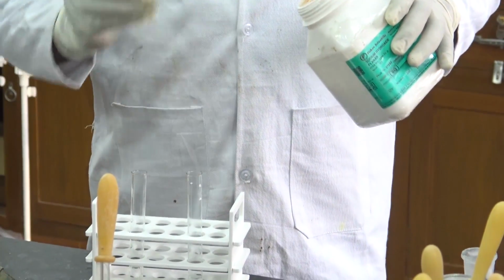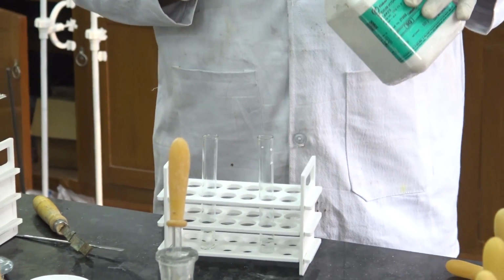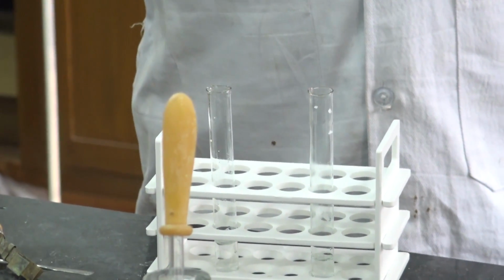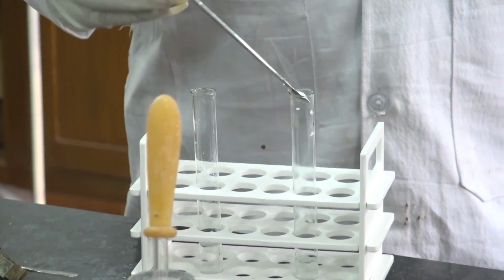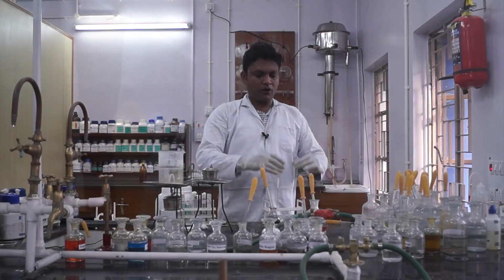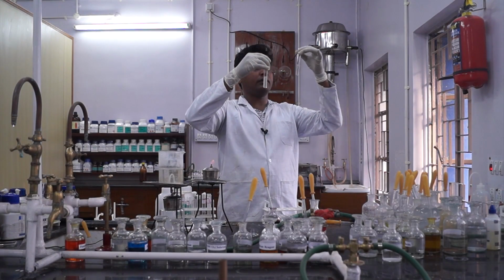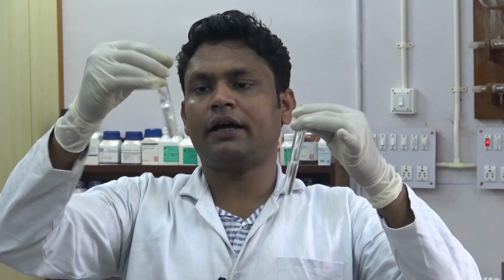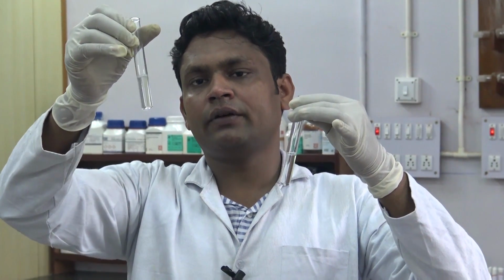Now add sodium hydroxide flakes to make it properly basic. Now we have dissolved the two solutions. On my left hand is aluminium solution and right hand is distilled water with the sodium hydroxide flakes.